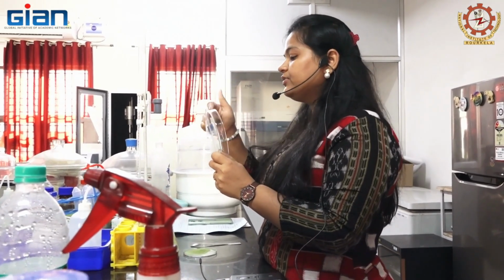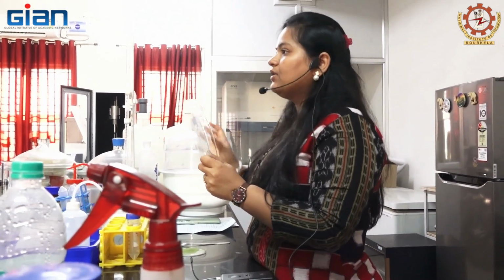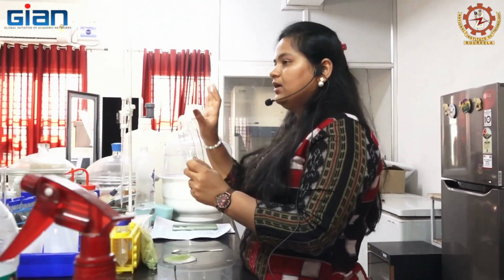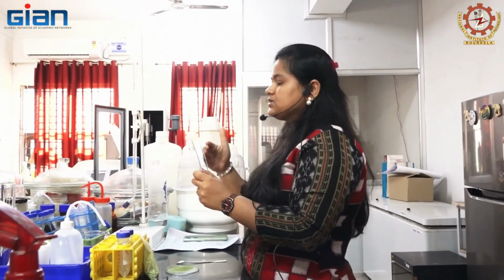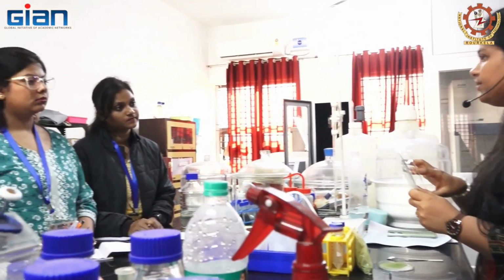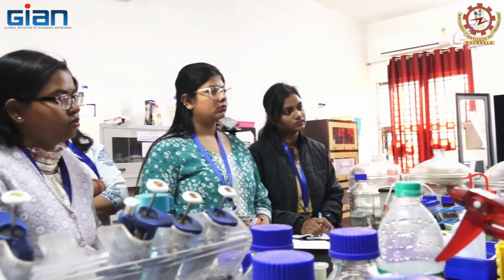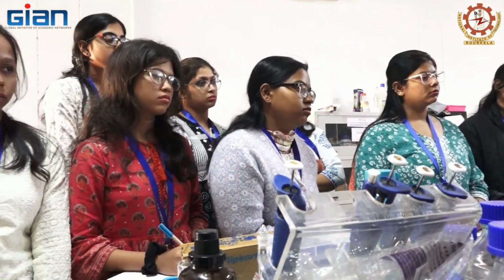The temperature will disrupt the cell walls. After the cell wall is ruptured, the solvent surrounding the cells will go inside the cells, and it will mix with the bioactive compounds or target compounds inside. Then these will be dissolved into the solvent surroundings.